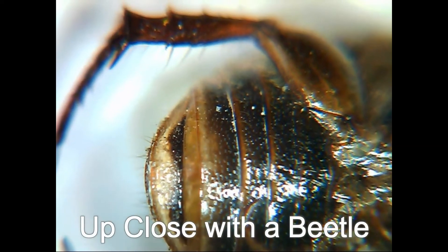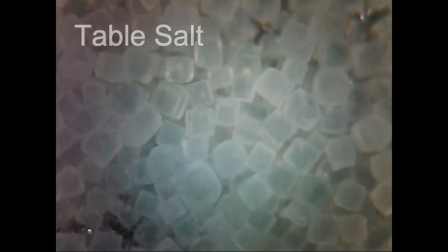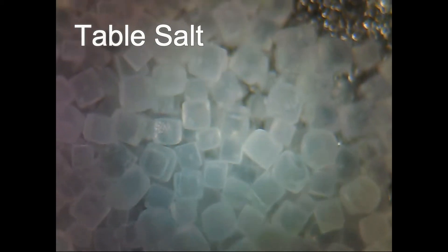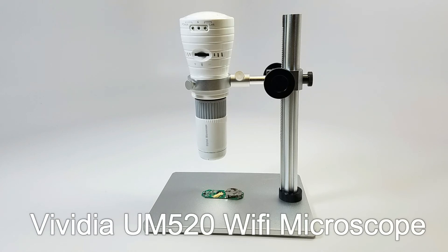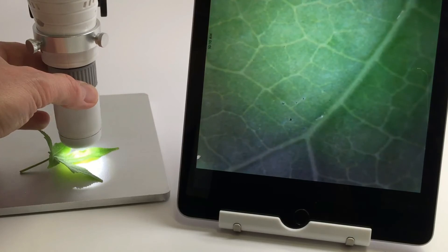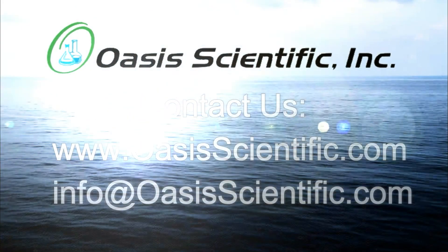Take photos, record video and save directly to your phone, tablet or PC. Look at plants, insects and other unique objects up close and discover something new with the Vividia UM520. If you would like to purchase or have any questions about the Vividia UM520 Wi-Fi microscope, please contact Oasis Scientific.